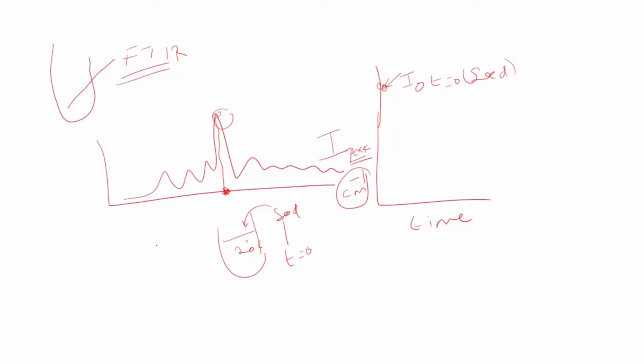So once we add the seed, what happens? So you have your seeds inside. These are your crystals. So these crystals will start to grow, and that happens because your paracetamol will move from solution to your solid surface due to the supersaturation. Yeah? Supersaturation is the driving force. And this process will continue until the solution reaches an equilibrium.